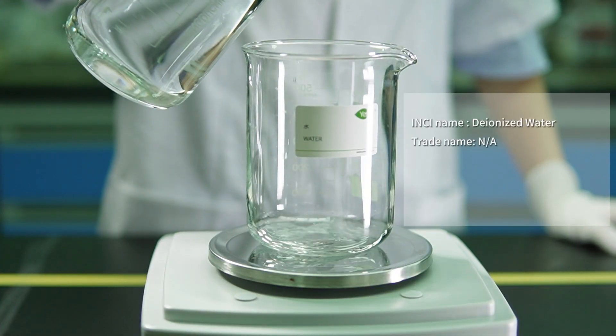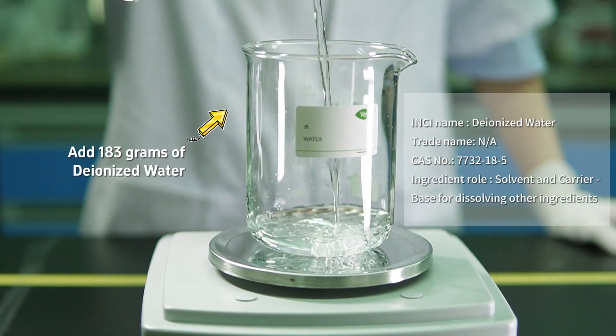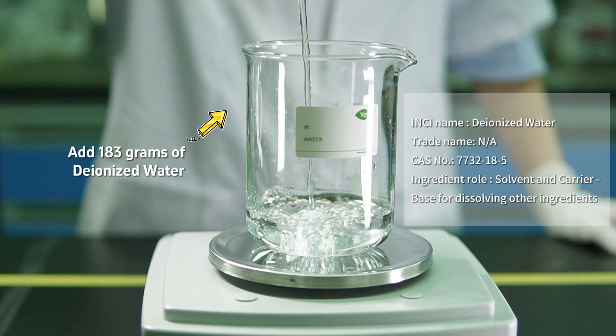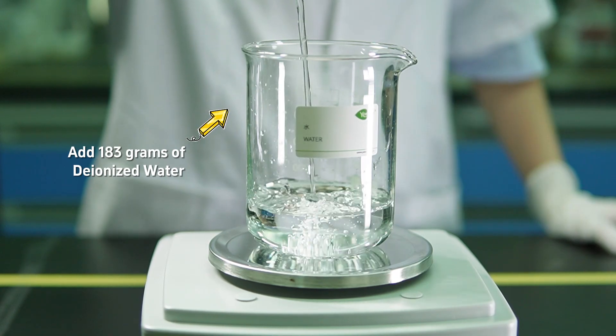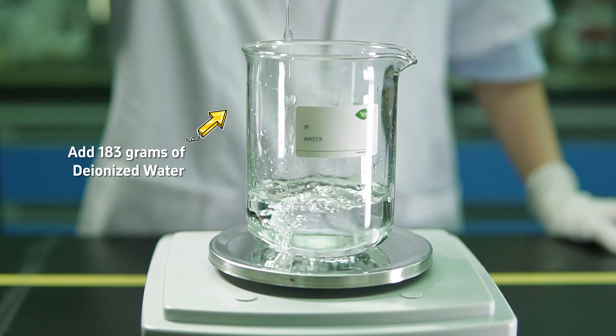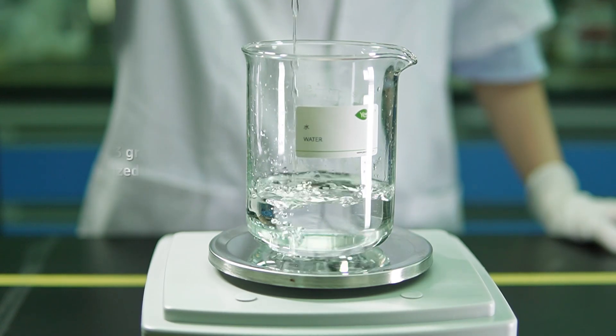In the first phase, we start with deionized water, which acts as our solvent and carrier. We begin by adding 183 grams of it. This provides a great base to dissolve all the other key ingredients that we'll be adding shortly in the Rose Petal Reverie Bath Gel.